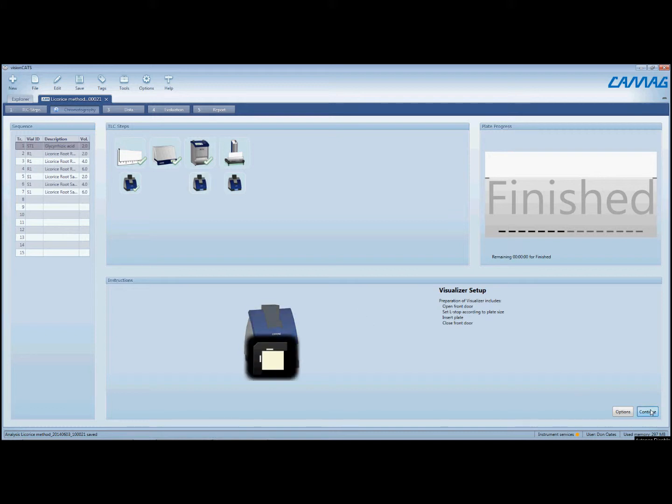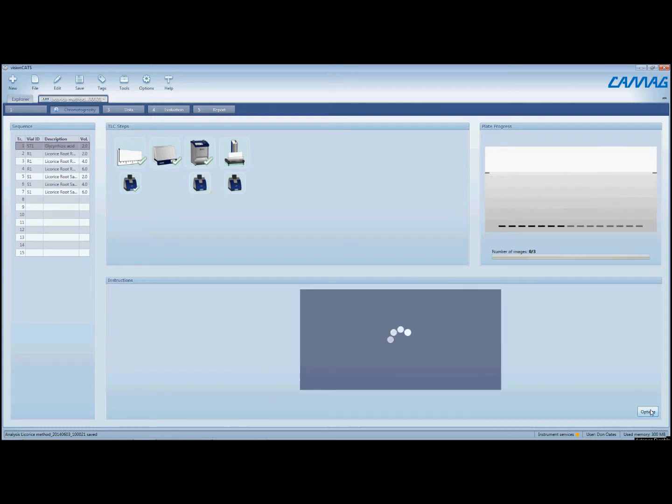We'll click continue, and the visualizer will automatically turn on the appropriate light sources and acquire the images accordingly.